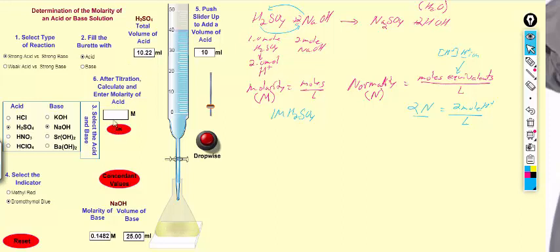We don't know what the concentration of the acid is yet. We can calculate that. The molarity of the base, the volume of the base, that's not going to change so long as we hit concordant values. All right, so I'll press concordant values, and it took 10 milliliters last time, so this time I'm going to go up maybe 9 milliliters. Oh, 9.5 is still too much.